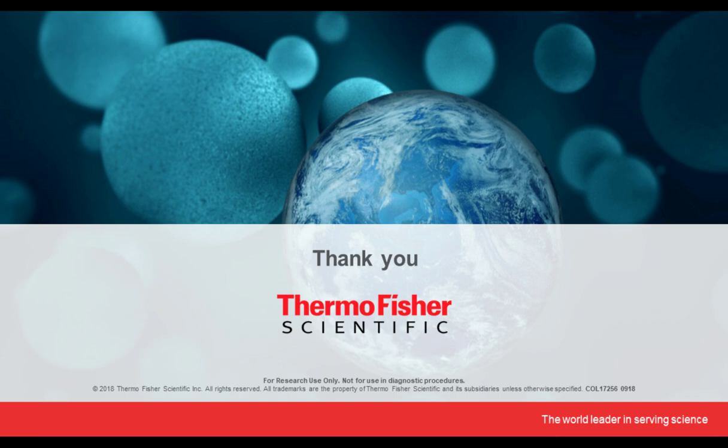Let's get started. Our first question is, do you use phosphopeptides for the phospho assay kit and non-modified peptides for the total assay kits?